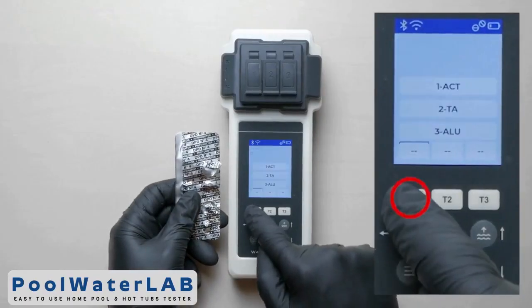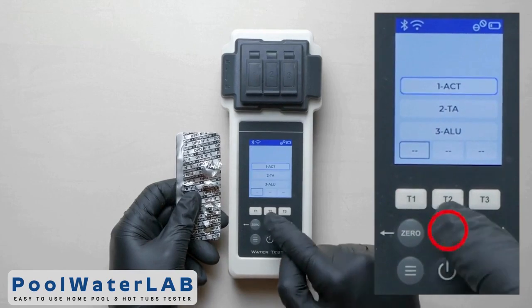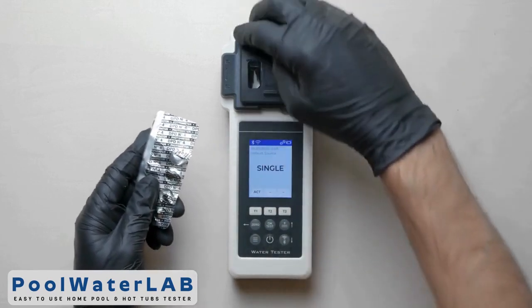Press the T1 button to go to the menu. Use the up and down buttons to select the desired parameter, then click OK to confirm the test.